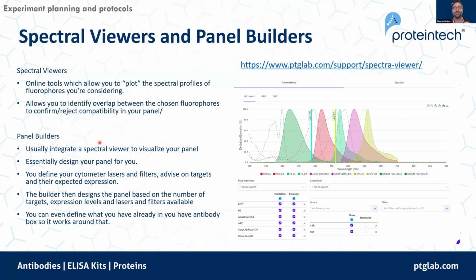So that part where I said where you shouldn't start, it allows you to start from that part. You can select the antibodies you have. You can then add in the targets you want to include, and it will recommend what fluorophores fit best within that particular panel. And at Proteintech, we've got both a spectral viewer and a panel builder as well. I'm going to just focus on the spectral viewer today, just in terms of looking at the principles of selecting fluorophores.